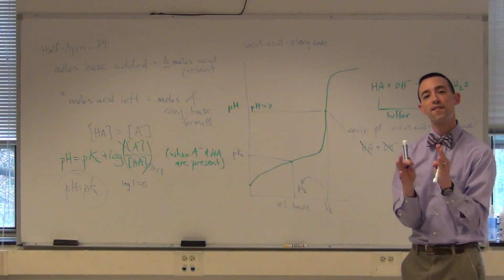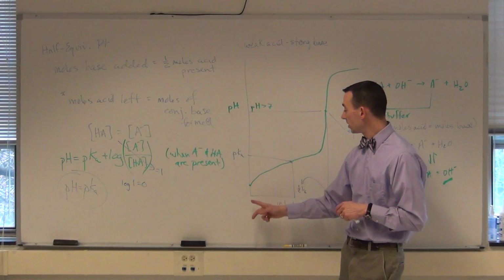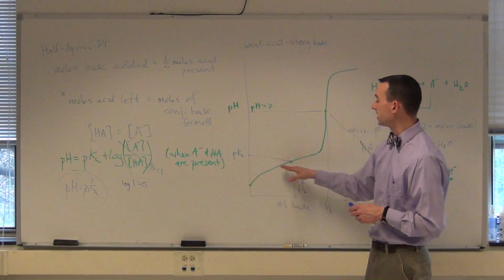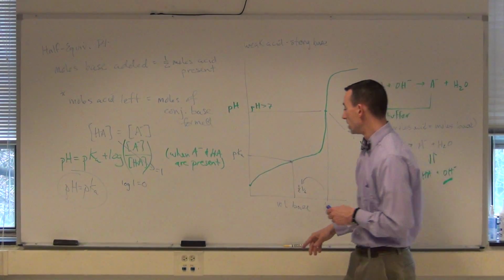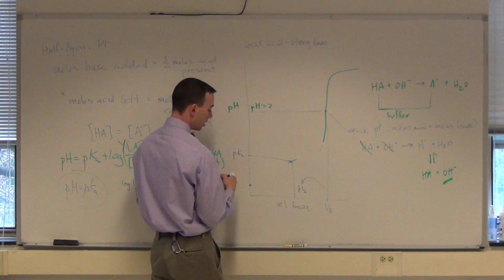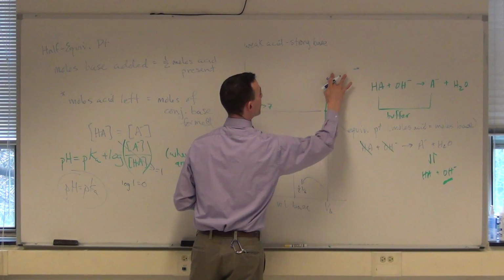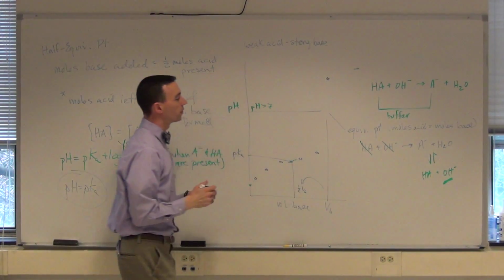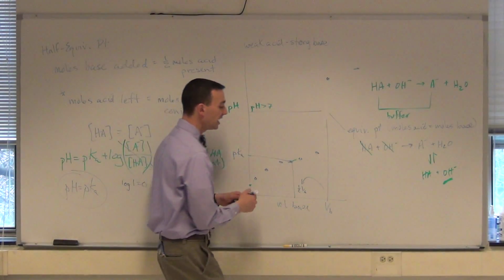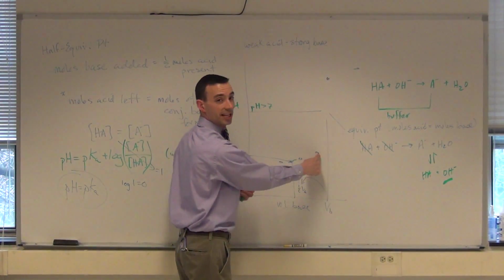Then you will do a rough titration of your acid, where you don't have to generate a lot of points, but where you quickly pour in the base to your acid, watching the pH. So if you were to graph that, it would look more like this probably. You would have just several points, and there would be no line there. So you probably would not see the equivalence point, but you would have a rough idea of what pH it does occur at by looking at these 2 points in particular.